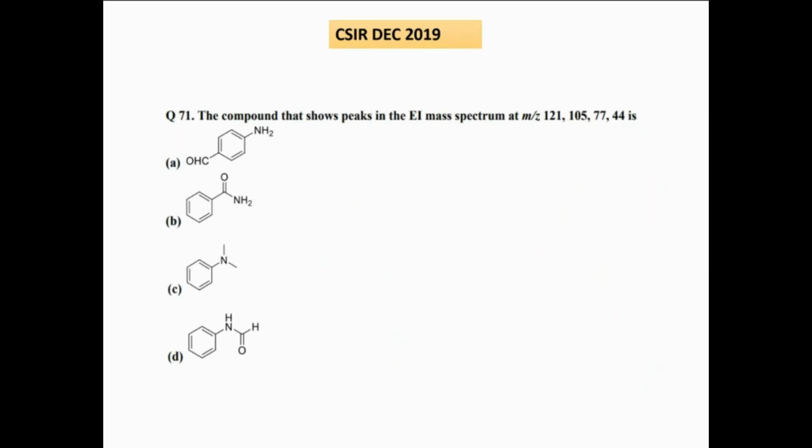The molecular mass கண்டுபிடிப்போம். First we'll find the mass, let me see whether it's having 121 as the mass. So you have 7 carbon into 12, so 84. Then you have 1 oxygen into 16, so 16. 1 nitrogen into 14 will be 14.